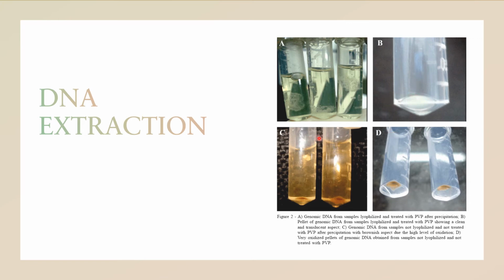If you have not done your extraction well, your DNA might turn yellowish like this, especially when the sample contains a lot of phenolic content. But this is A, and B is a normal picture for DNA extraction. So this is what you expect to see.